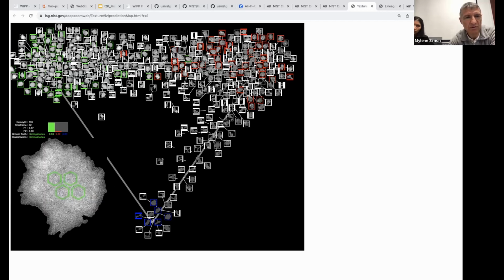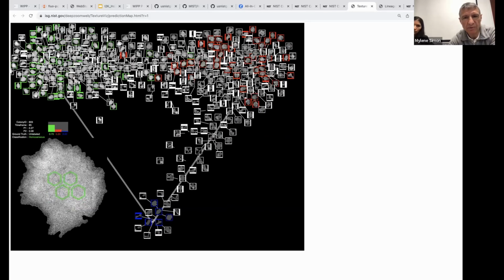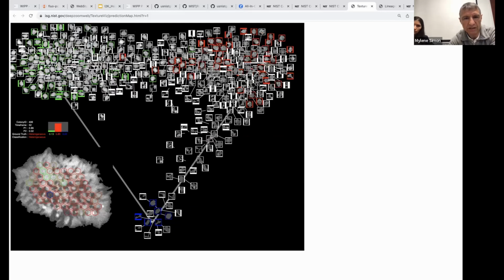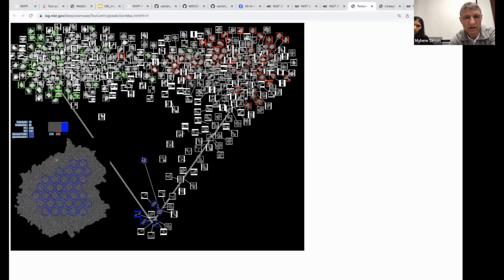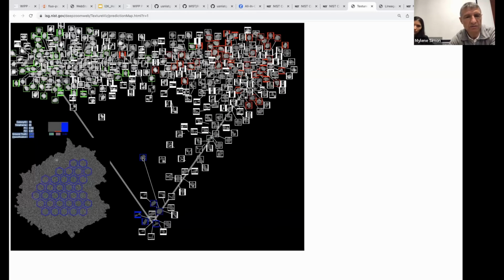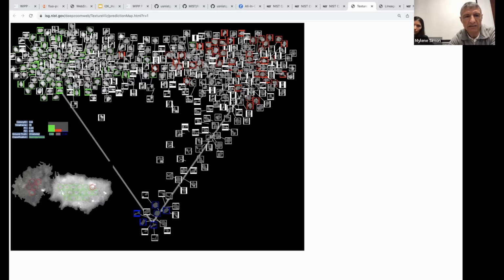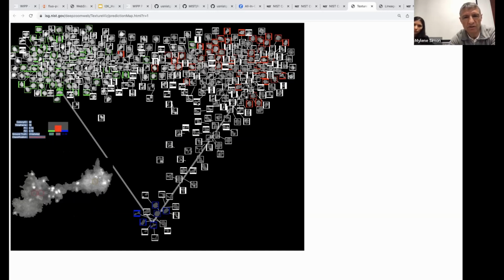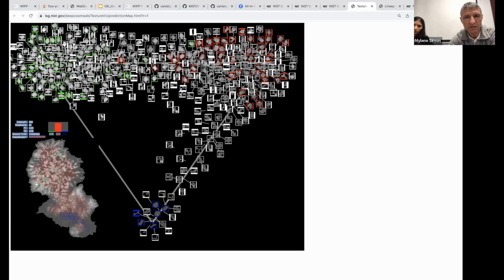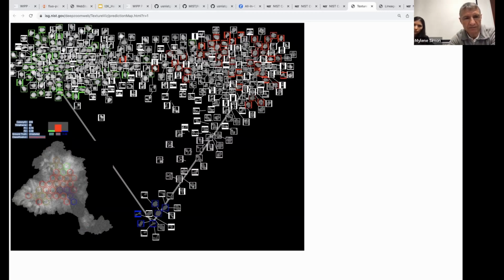So in the left upper corner, you see all the colonies that are homogeneous. In the right upper corner, you see all the heterogeneous colonies, and at the bottom, you see all the colonies that didn't express the OCT4. The red and green here indicate that some of them were visually verified, so they formed a ground truth data set, and the rest was automatically assigned. The position here just reflects the degree of homogeneity.